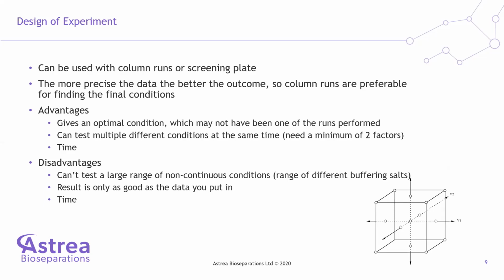It can also test multiple different conditions at the same time, which will help offer time savings, which is one of the advantages. However, time can also be a disadvantage. This is an all or nothing result. You need to have run all the column runs that the model specified to get the result that you need out. Therefore, if you don't have sufficient amount of time to run all of those experiments, this approach isn't going to be appropriate for use.